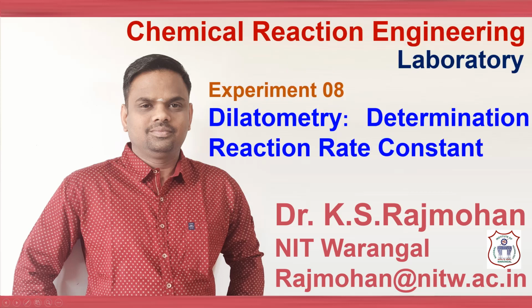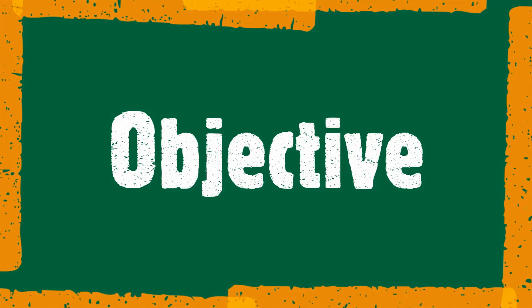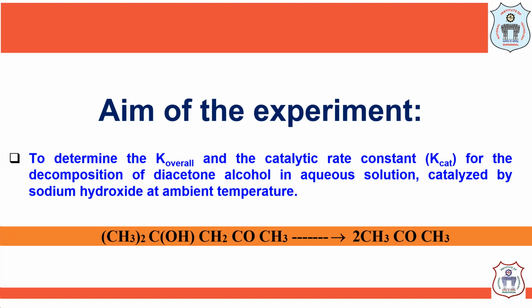In this video, we demonstrate experiment number 8 in the chemical reaction engineering laboratory, which is reaction rate constant by dilatometry: to determine the overall rate constant and the catalytic rate constant for the decomposition of diacetone alcohol in aqueous solution catalyzed by sodium hydroxide at ambient temperature.